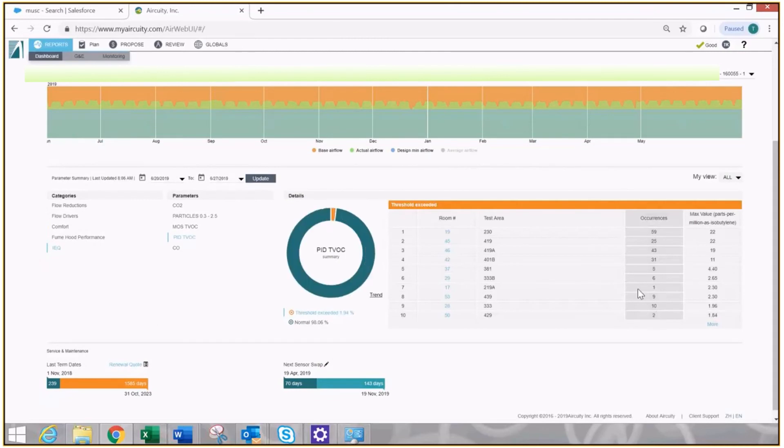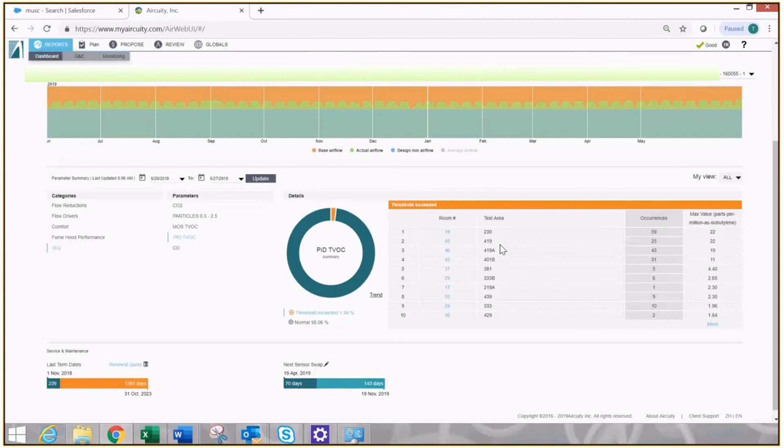Scans the entire building. I'm going to see one, two, three, four rooms that I'm worried about. Enough occurrences that I want to go take a look at. Interestingly, 419 and 419A are on that list as well.